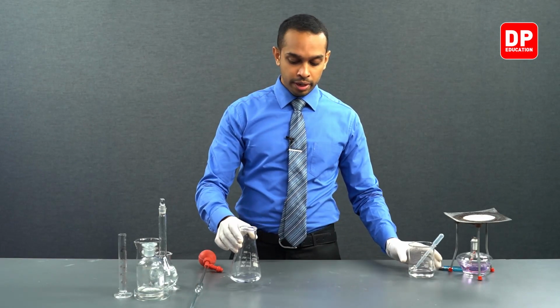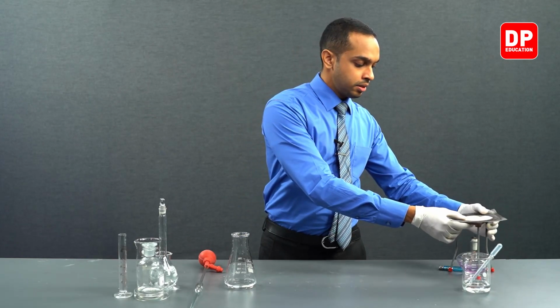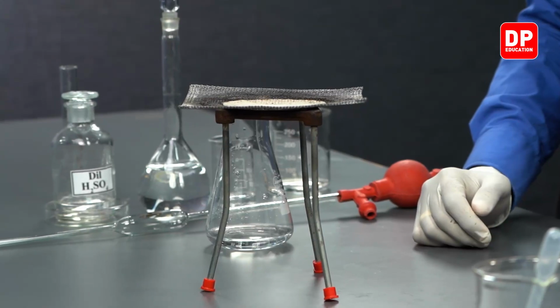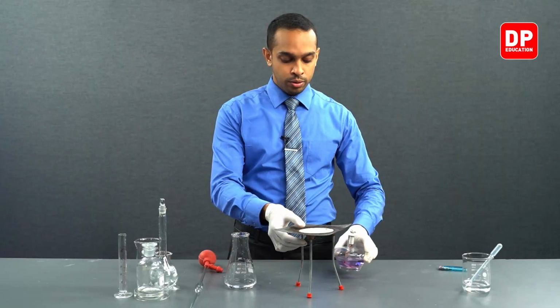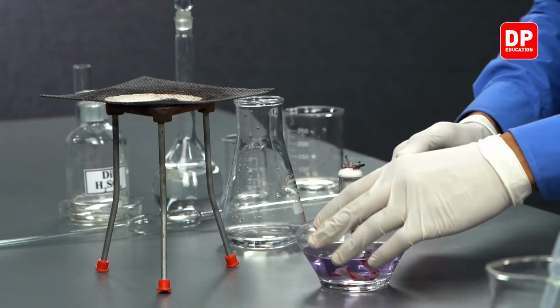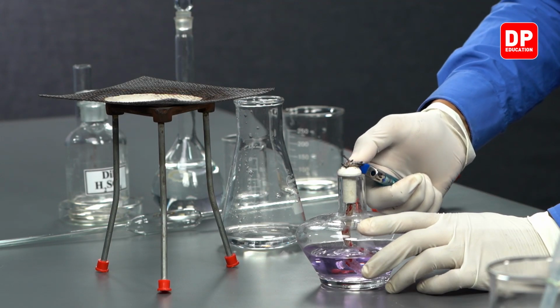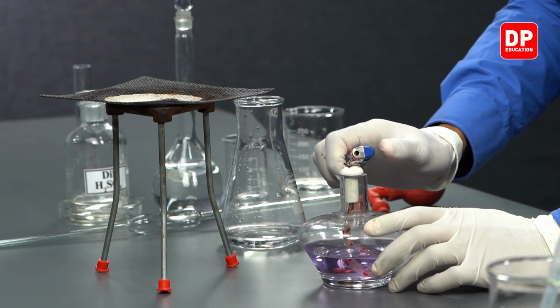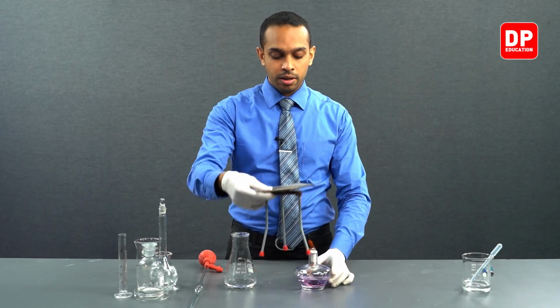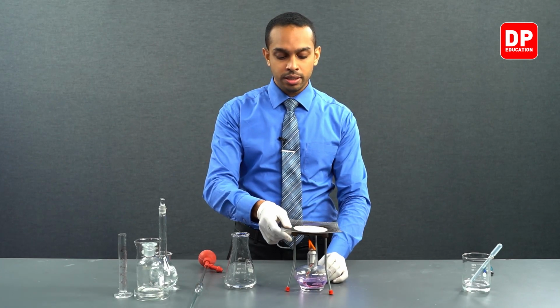In order to do that, we will be using a spirit burner and a tripod and a wire mesh. So we will light the spirit burner first. After lighting the spirit burner, we can place our tripod and a wire mesh like this.